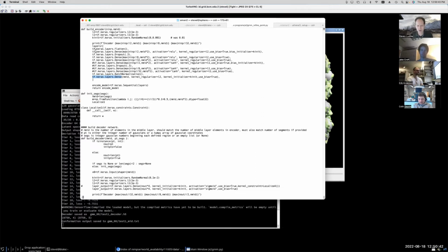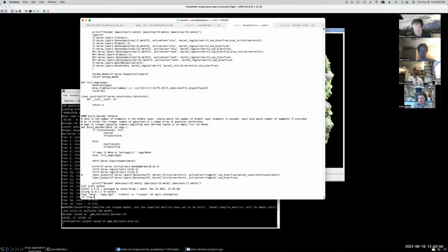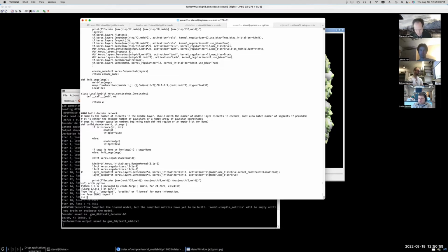Okay, so I mentioned that what goes into this network is basically a TensorFlow tensor object. So if we run Python, from EMAN2 import star. I talked about this a little bit, like with NumPy, in the lectures that weren't recorded before we'd invited everyone.